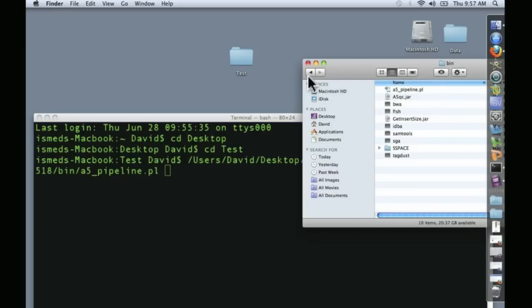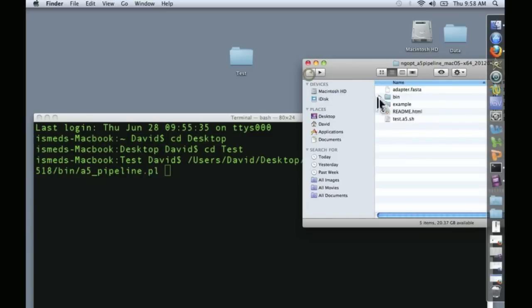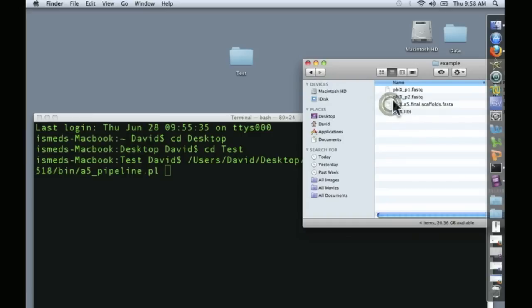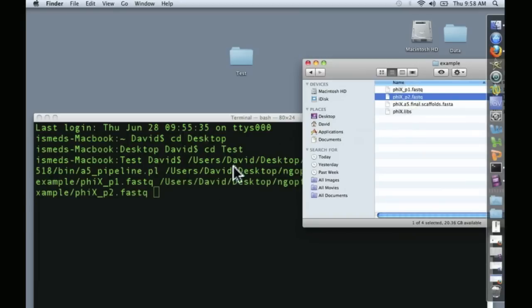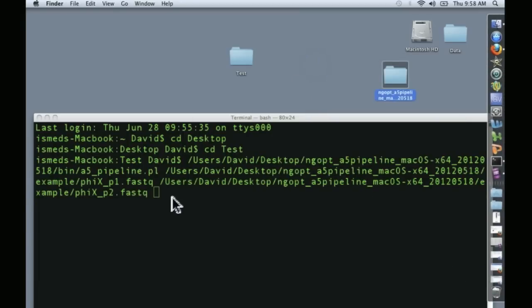Now we need to give it two input files and these are the two different paired-end read files. Let's go back to our example and here's paired-end 1 and paired-end 2. All that remains is to give a name.